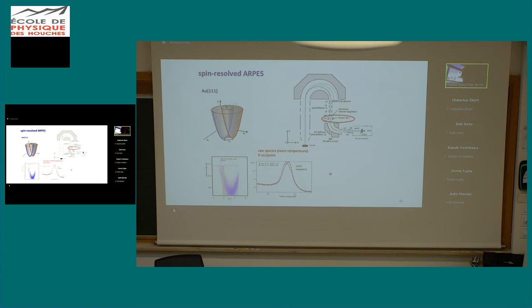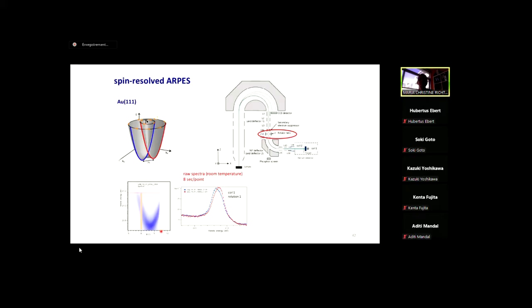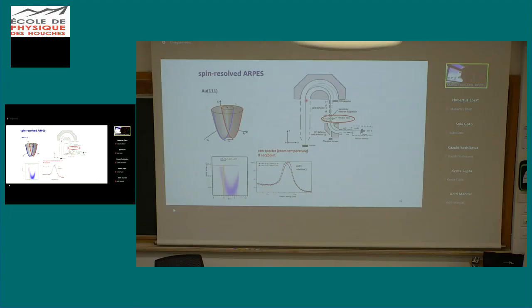So to get the geometry right of this, the theta angle, which is the k vector here, is parallel to the slit. So the entrance slit is parallel to y. It's got the direction of y in this system of coordinates, and that means that if we cut this parabola along y, then we will have the spin direction in the x direction, not the y direction.